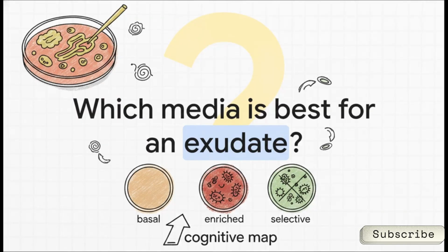So, let's put this all together. If an exudate specimen, like pus from a wound, arrived in your lab right this second, would you streak it on basal, enriched, or selective media first? Think about what we just covered regarding heavily mixed specimens versus delicate pathogens. If you can confidently answer that question, you've got the cognitive map you need to absolutely dominate your microbiology practicals.